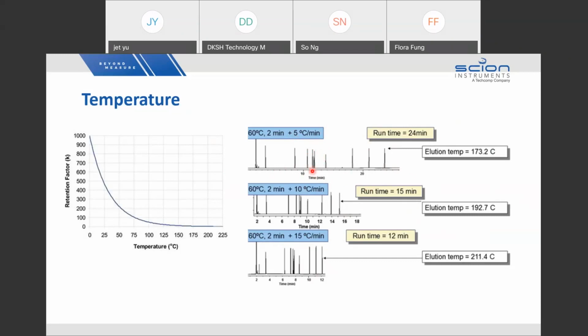It's already close nearby. I think the resolution is about 1.2 something. You think about these 2. If you change the condition over here, it may affect the separation of these 2 peaks. So this is very important: the start point where you should start to change the conditions without affecting the rest.